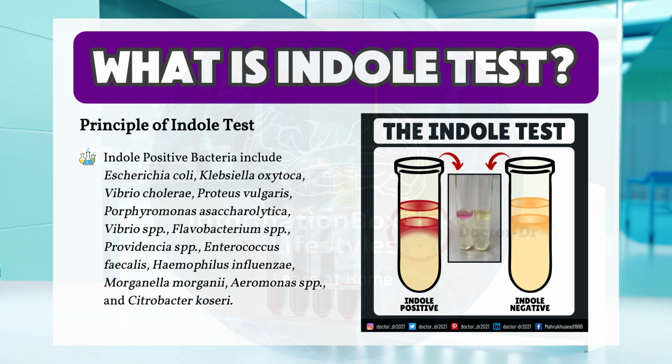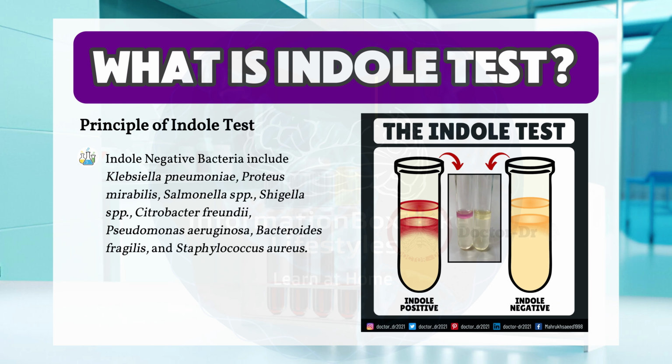Indole-positive bacteria include Escherichia coli, Klebsiella oxytoca, Vibrio cholerae, Proteus vulgaris, Porphyromonas asaccharolytica, Vibrio spp, Flavobacterium spp, Providencia spp, Enterococcus faecalis, Haemophilus influenzae, Morganella morganii, Aeromonas spp, and Citrobacter koseri. Indole-negative bacteria include Klebsiella pneumoniae, Proteus mirabilis, Salmonella spp, Shigella spp, Citrobacter freundii, Pseudomonas aeruginosa, Bacteroides fragilis, and Staphylococcus aureus.